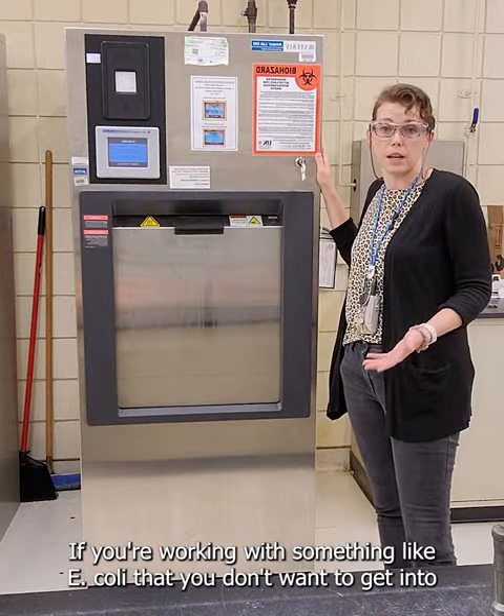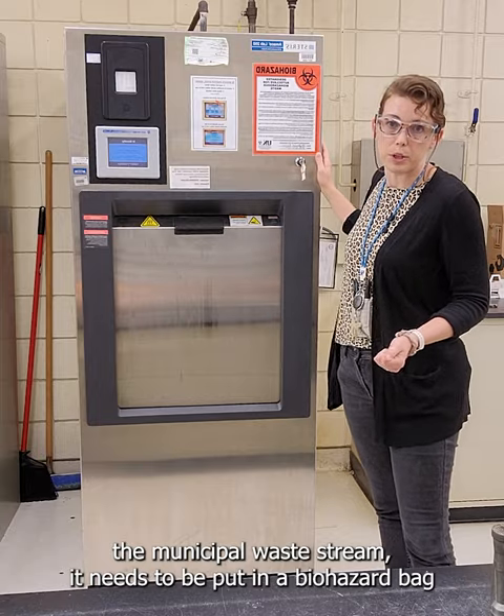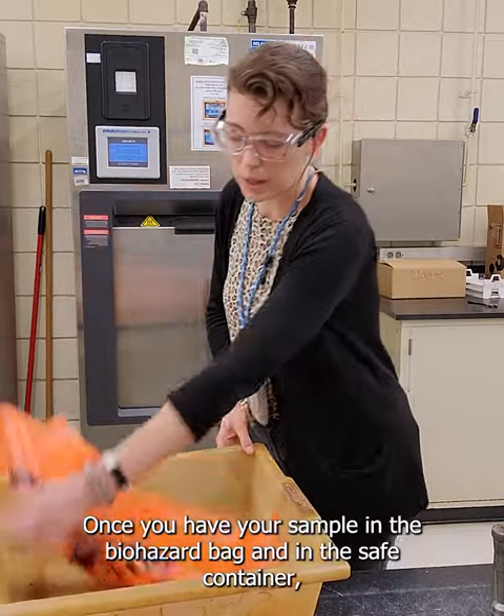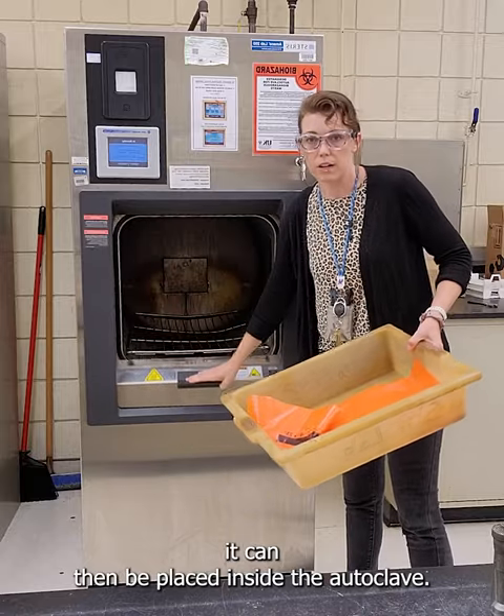If you're working with something like E. coli that you don't want to get into the municipal waste stream, it needs to be put in a biohazard bag like this that's clearly labeled that it's a biohazard. Once you have your sample in the biohazard bag and in the safe container, it can then be placed inside the autoclave.